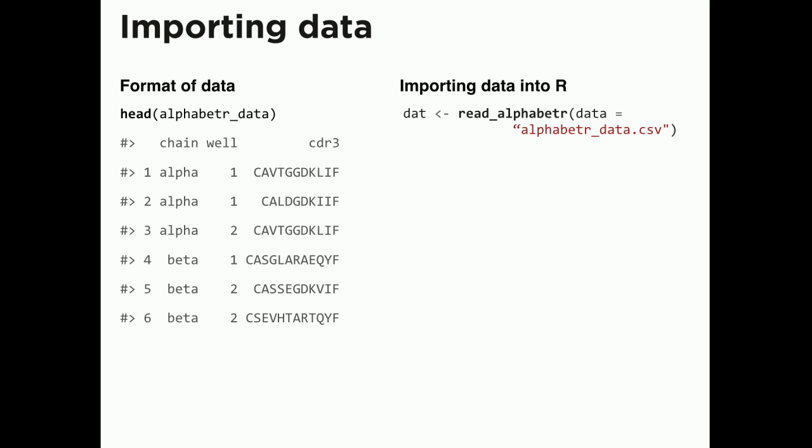Can you account for sequence errors, so that sometimes you have not exactly the same sequence, despite the fact that it's the same receptor? So you're talking about substitution errors in the sequencing? The question was, how does this account for sequencing errors?